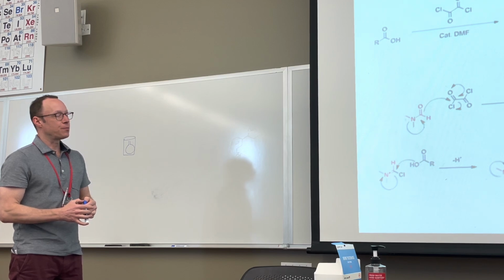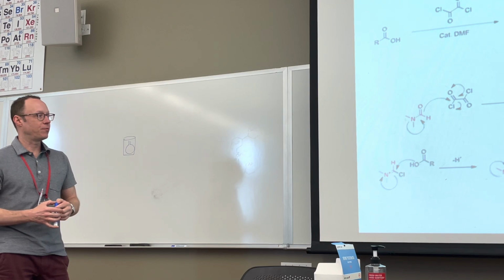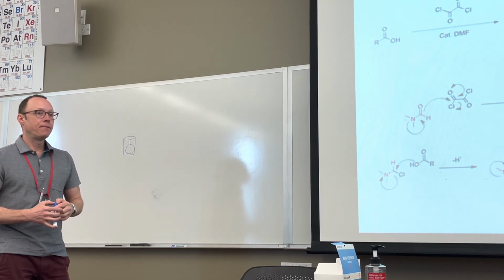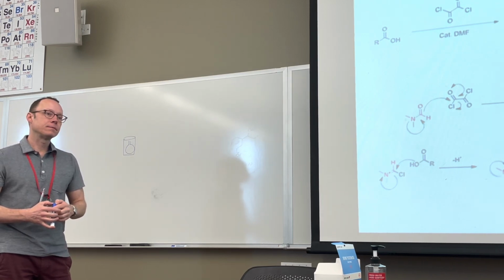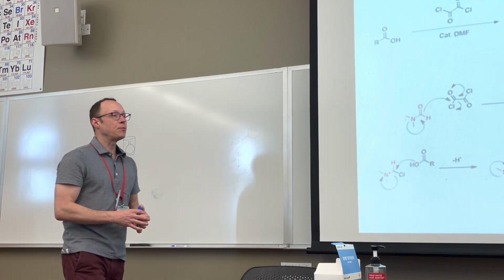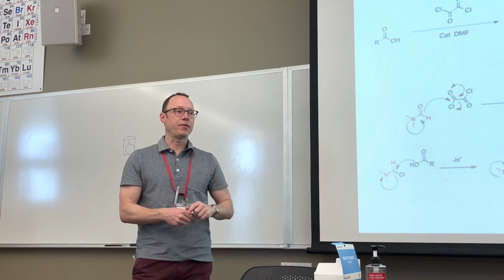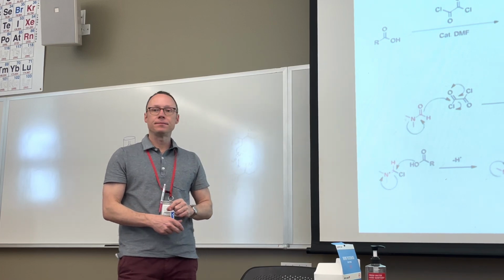Other than that, I think it's fairly straightforward for those of you that have procedure B. There were 3 of us on that committee too? So should we use all 3 teammates that are in the room, or go to a different room for that? No, I'll just set up one stir plate and all 3 of you can share that stir plate. That makes sense.